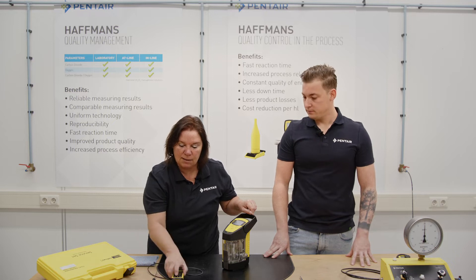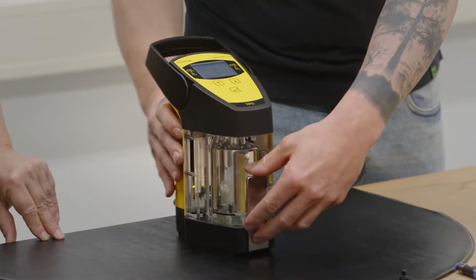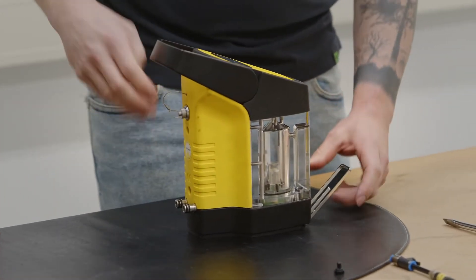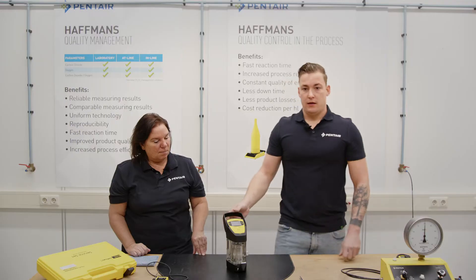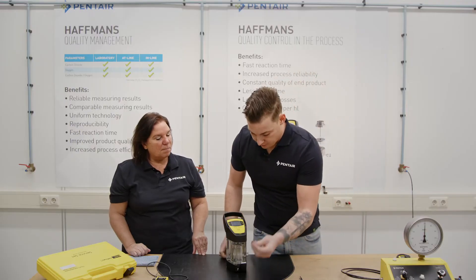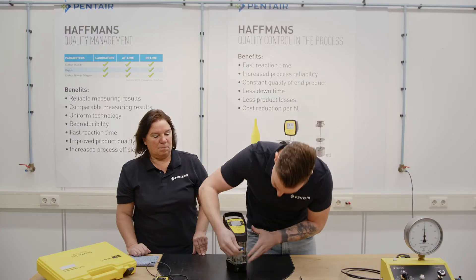When that is fine, then we are ready for the pressure check. Now we remove the liquid from the measurement chamber, and we take out the calibration screw and put the calibration adapter in it.